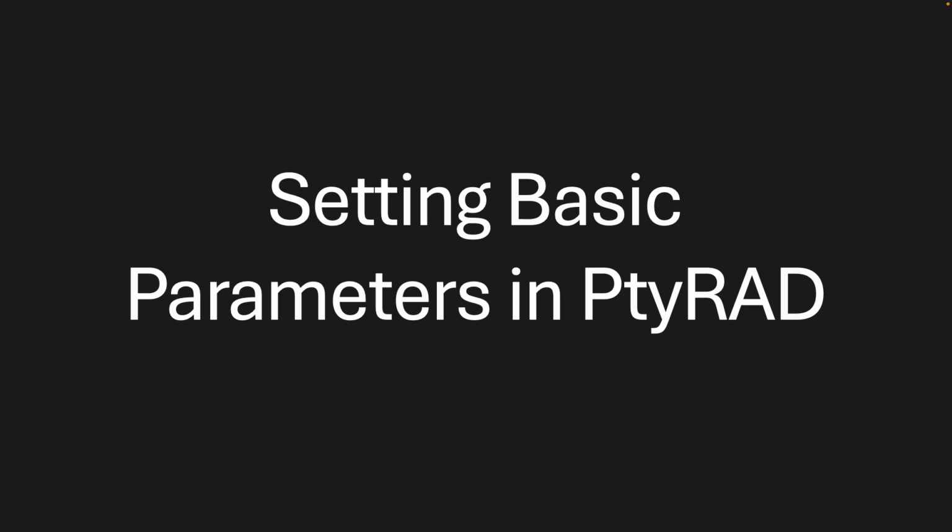In this video, we will go over a very brief introduction on setting parameters in PtyRAD. Parameter setting is incredibly important, as the success of a ptychography reconstruction is dependent on finding the right parameters for your particular dataset. A reconstruction in PtyRAD is fully configured by a single YAML parameters file, and all you need to do is edit one parameter file to set the parameters.